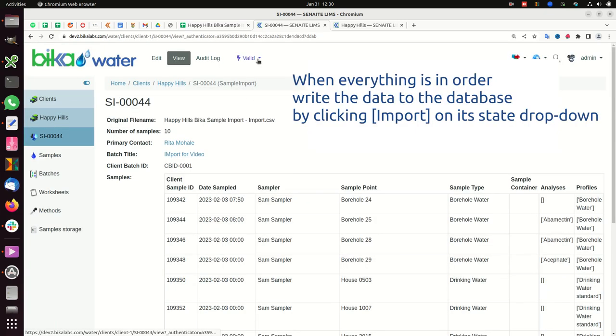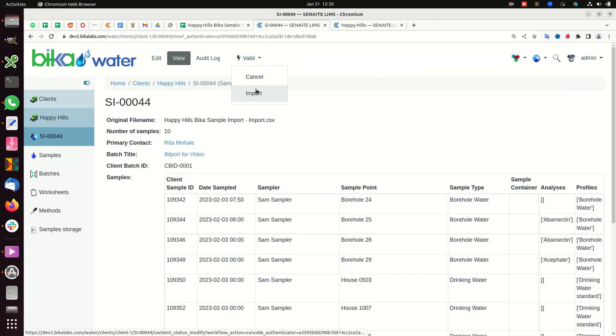When everything is in order, write the data to the database by clicking import on its state dropdown.